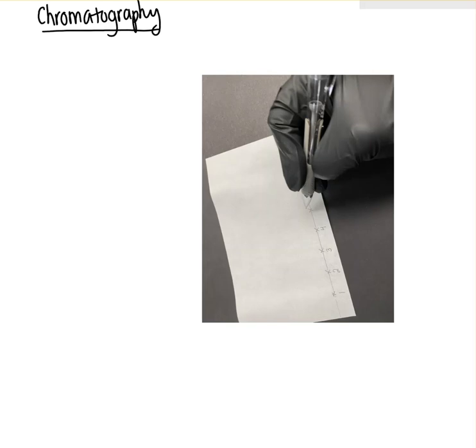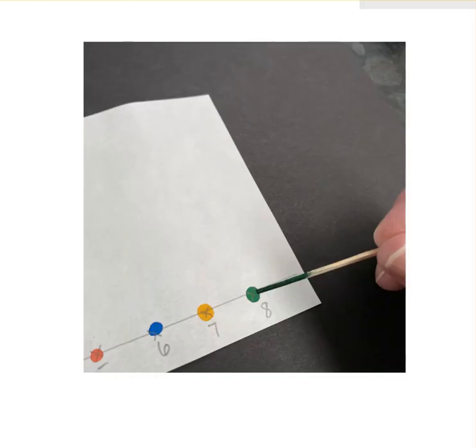This experiment is chromatography. We're going to do the chromatography of dyes, where we separate them into their different pigments or individual compounds that make up the total color. We start by labeling our chromatography paper, and we're labeling where we're going to put the different dyes. Then we apply the different colors of dye to the X's, and notice they're on this line. That's our starting line.